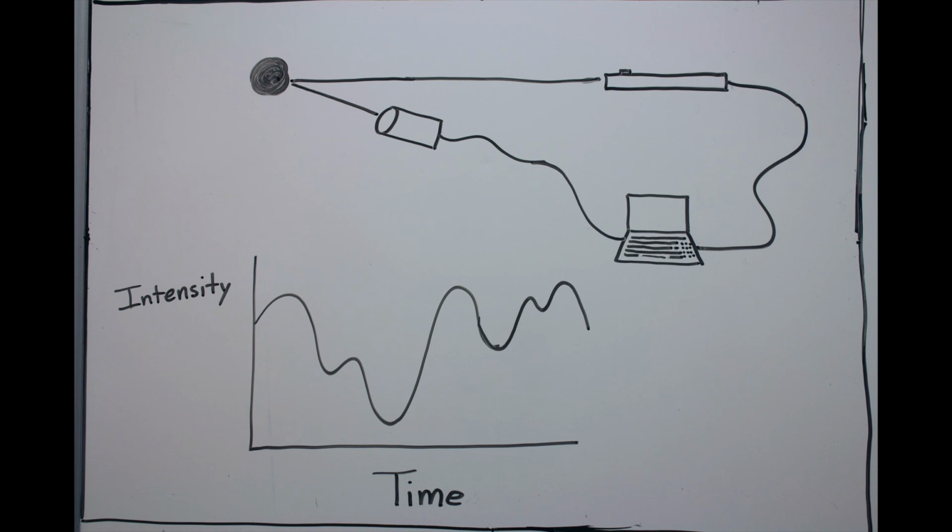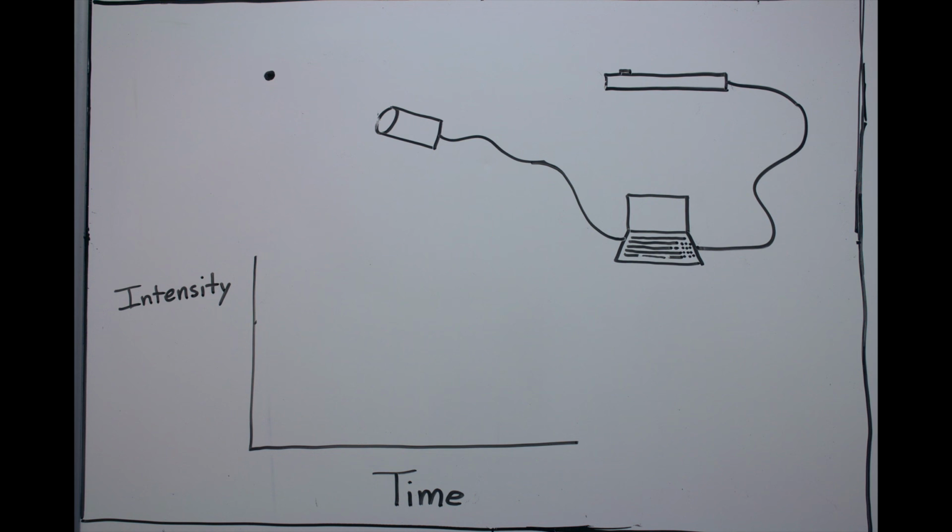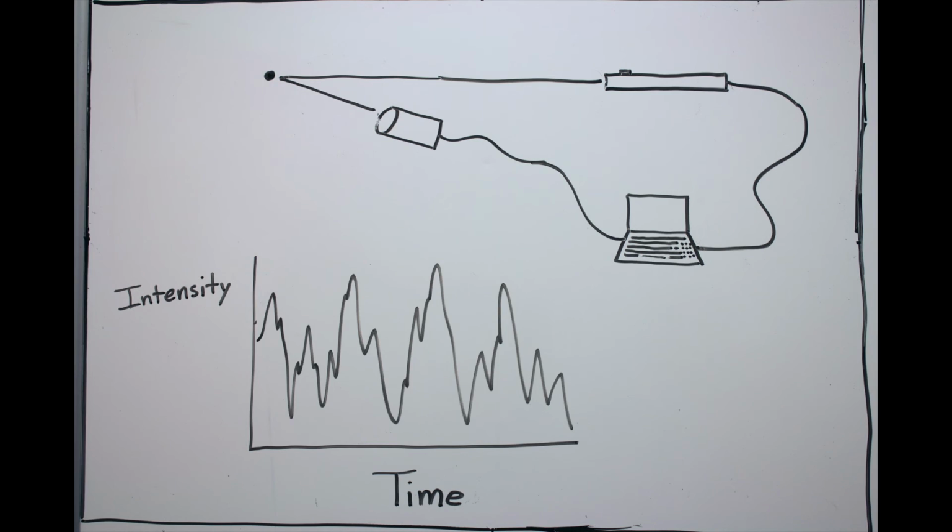Two of the most popular methods for determining particle size are laser diffraction and dynamic light scattering. Laser diffraction works by measuring the angular variation in intensity of light scattered as a laser beam passes through a well-dispersed sample. The angular scattering intensity received is then analyzed to calculate the size of the particles responsible for creating the scattering pattern. A volume distribution is obtained, which shows the volume percentage of particles at a given size.